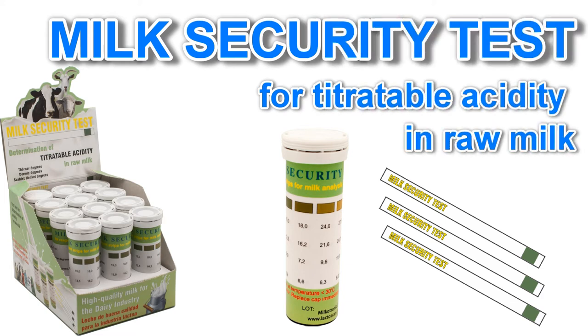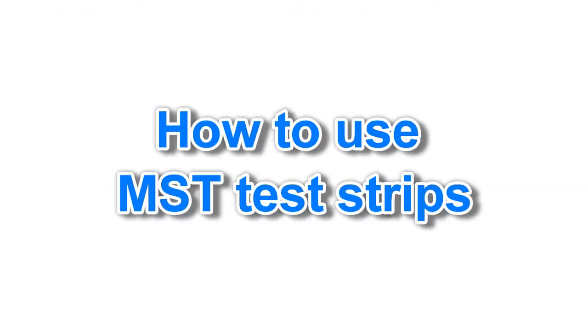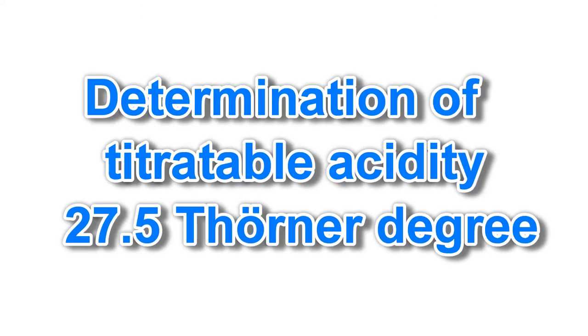Milk Security Test is a rapid strips test for determination of titratable acidity in raw milk. Measurement of titratable acidity or lactic acid is a very important test used to determine the quality of raw milk. It can be measured in Therner, Dormic, Soxlet-Henkel degrees, and pH.